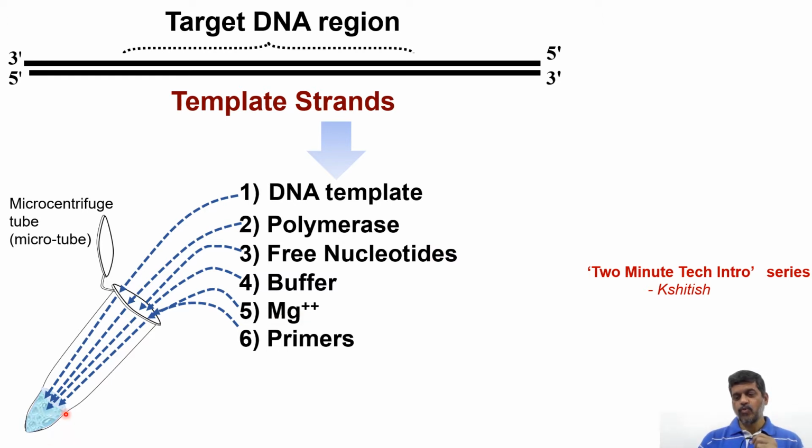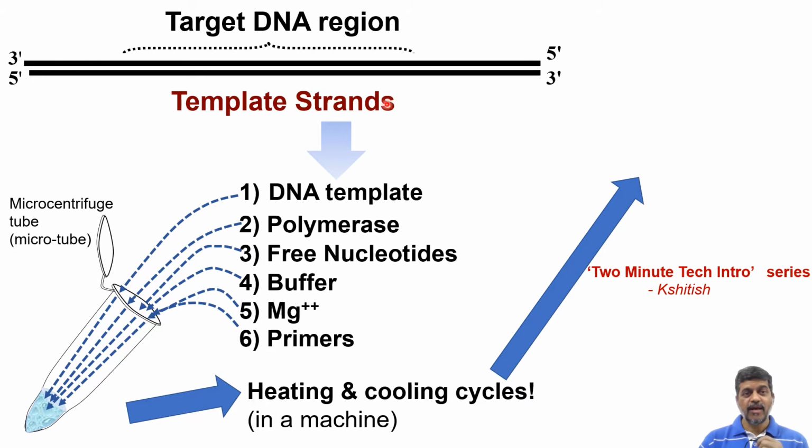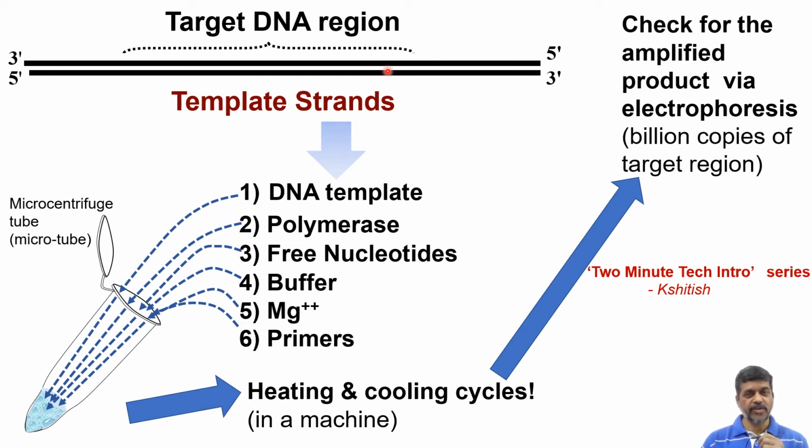The reaction mix will be subjected to heating and cooling cycles, about 30 of them. And then at the end of about 2 hours after 30 cycles, we would like to test if the reaction has worked. That means I would expect about 1 billion copies of the target molecule. How do I test that? By electrophoretic analysis. Now let's see, when I said 30 cycles, how each cycle works.